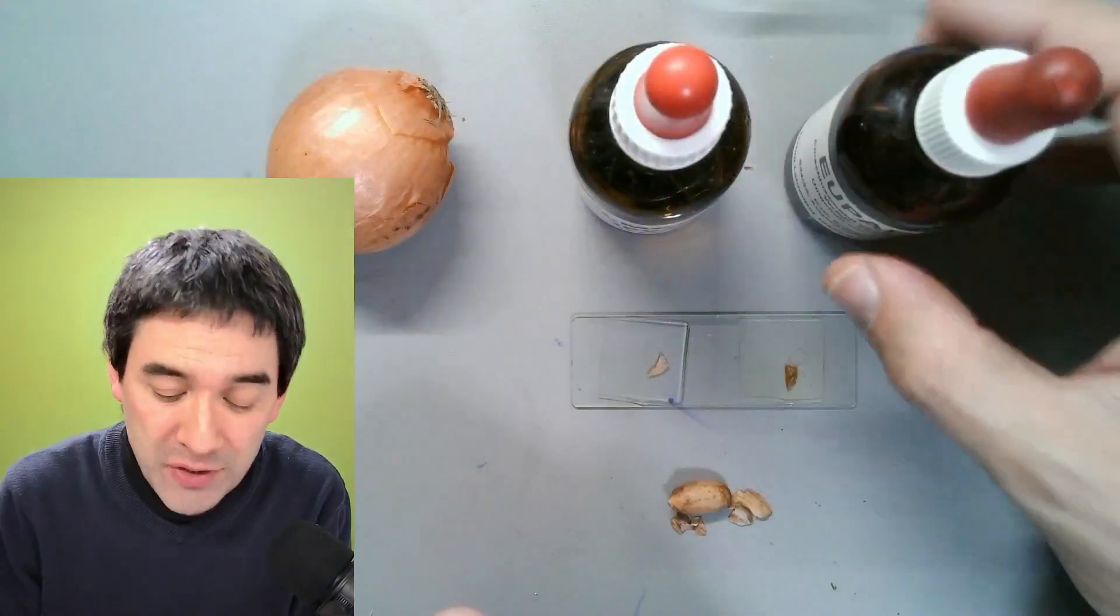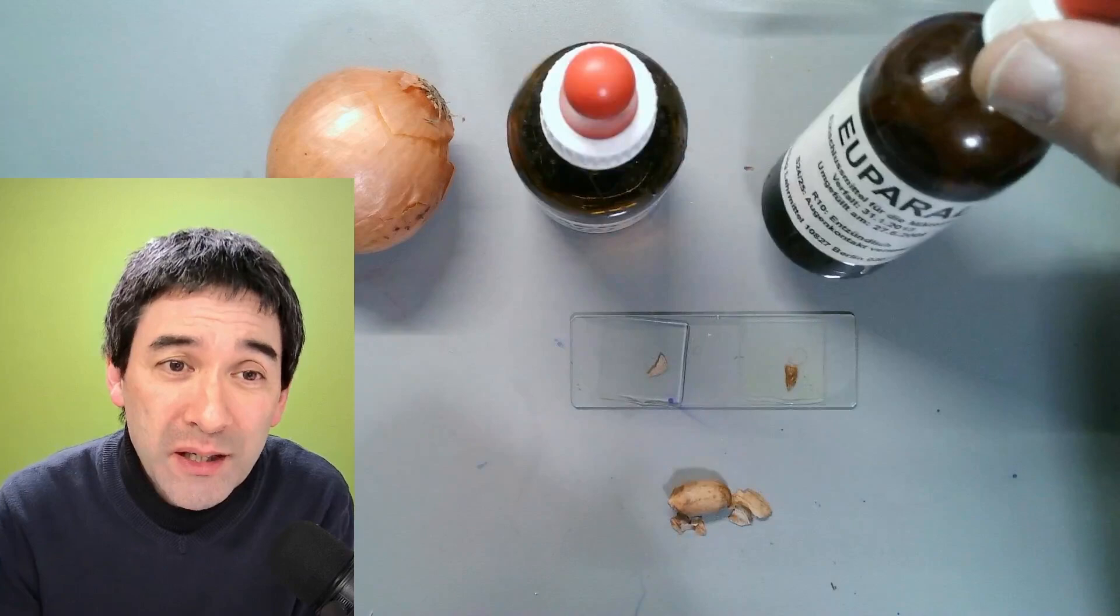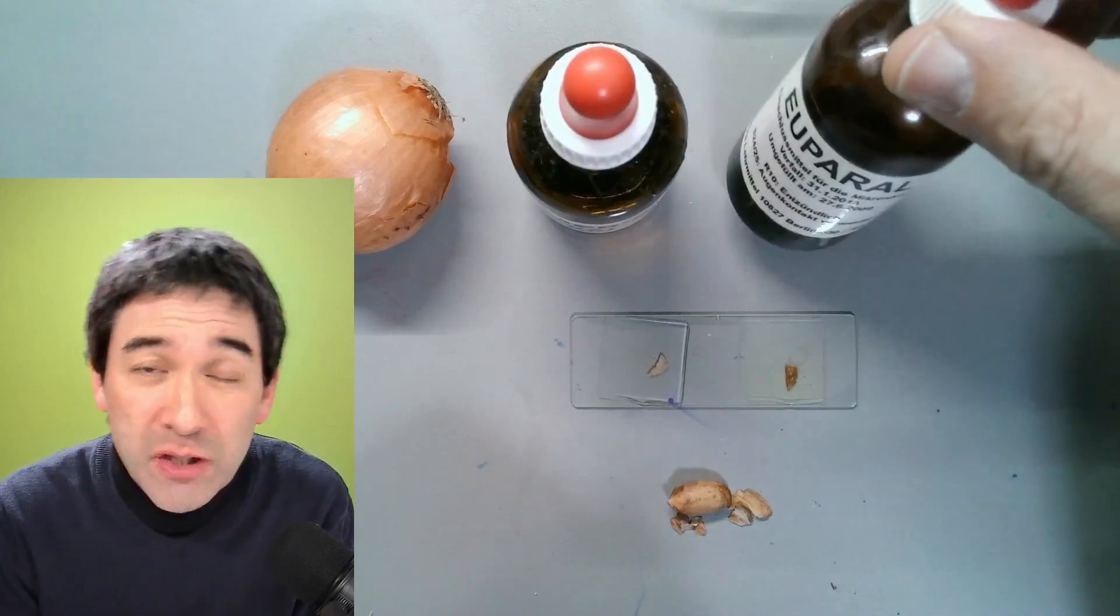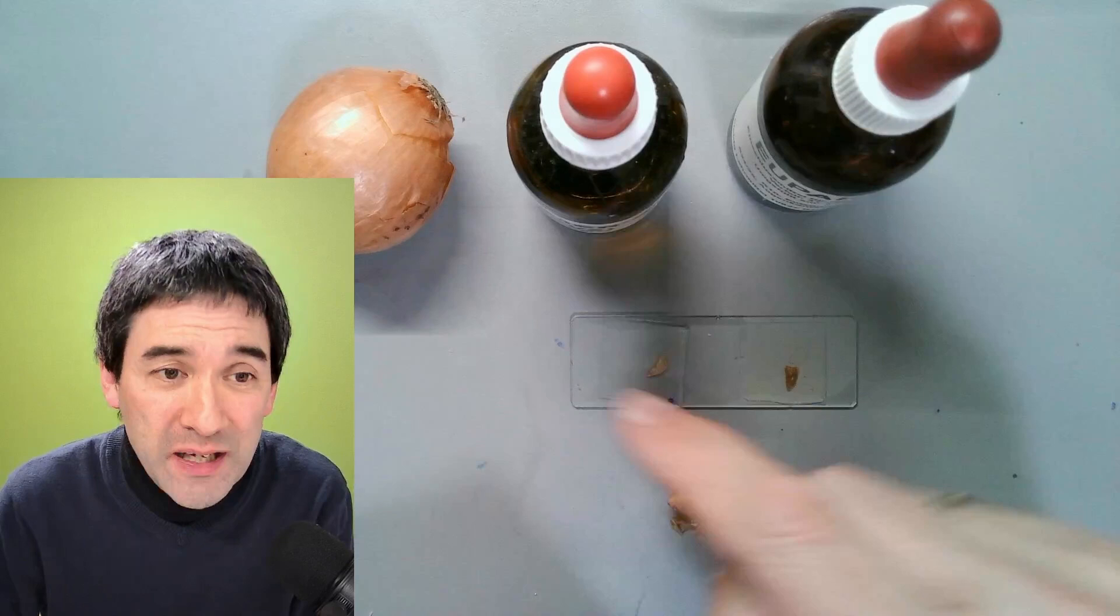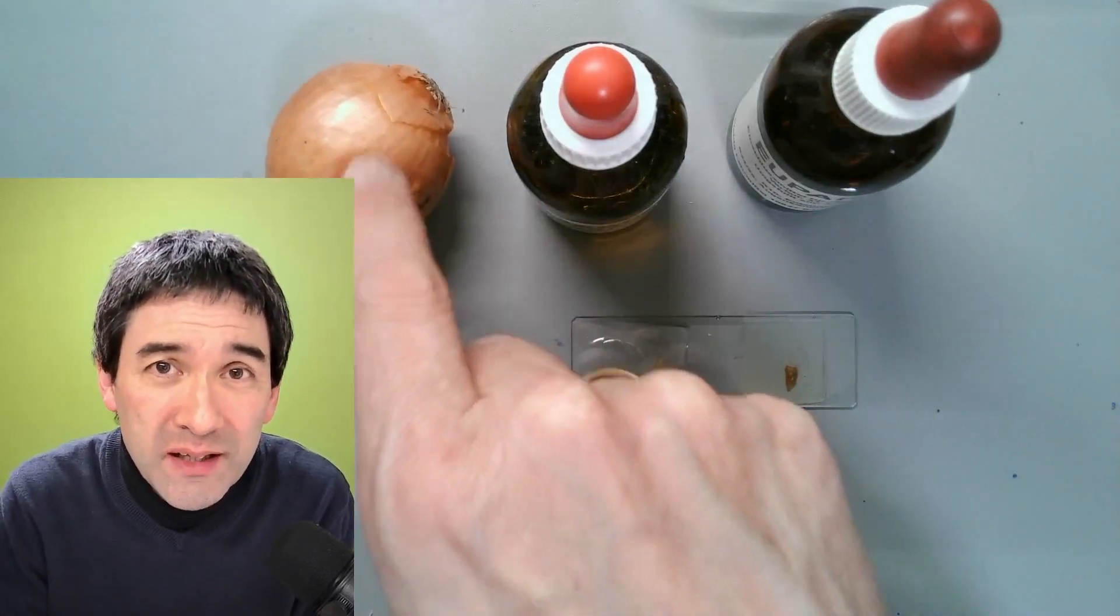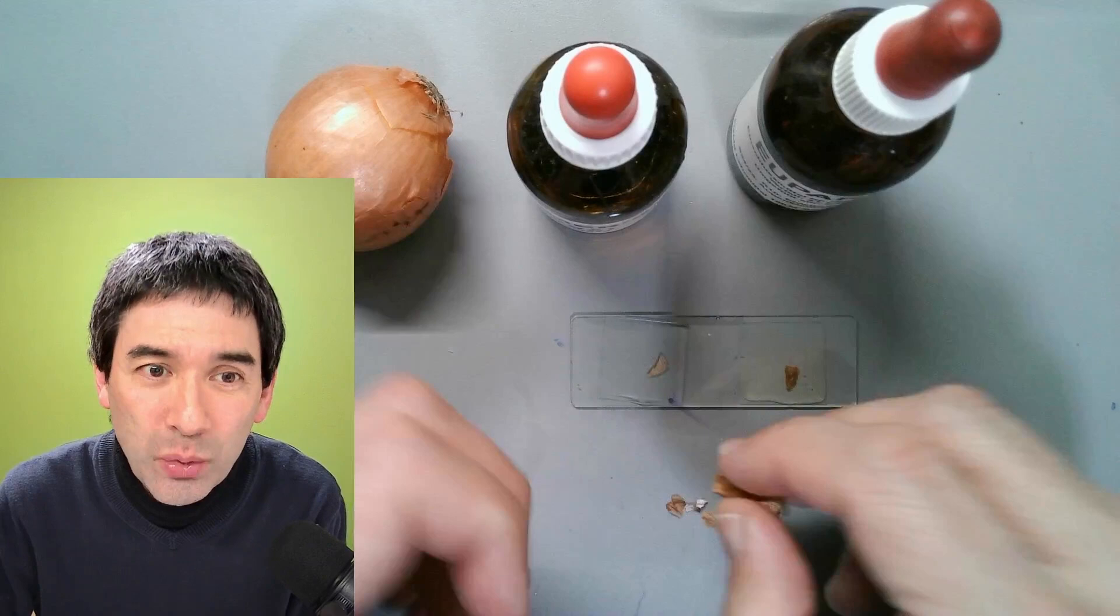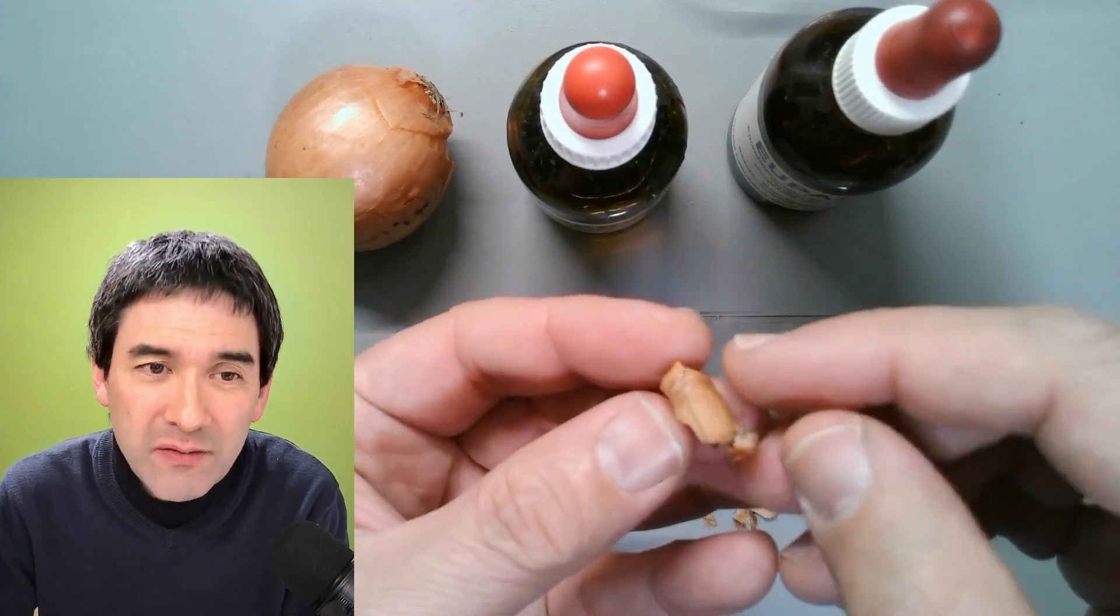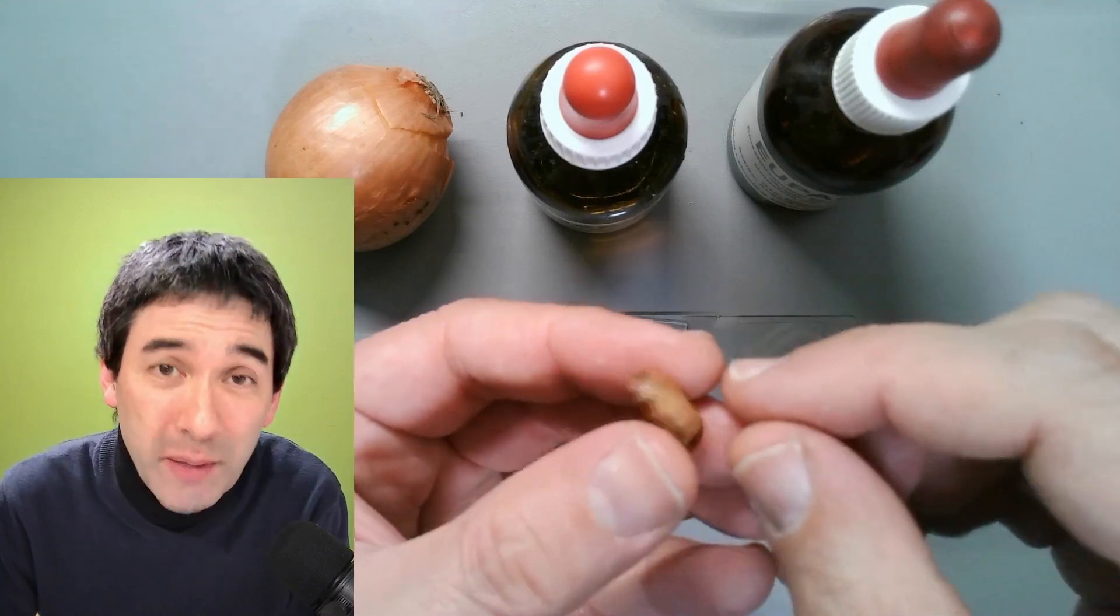So I've got two mounting media here. This one is PVA glue, a water-based mounting medium, and this is Euparal mounting medium, which is most commonly used for mounting insects. What I've done today is I did not take onion skin, but rather the seed coat of a peanut. It's very thin and papery and very suitable for observing under the microscope.